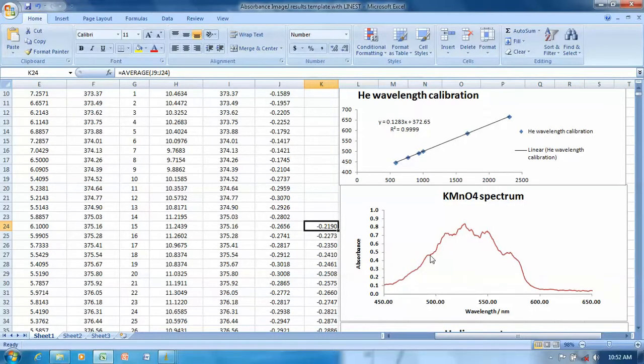Now this isn't necessarily the best, but I think what it does really nicely is give you a comparison between the visual absorption and the graphical output, and hence it's a great educational tool. It probably won't replace your diode array spectrometer, but actually, when you get right down to it, it almost could.